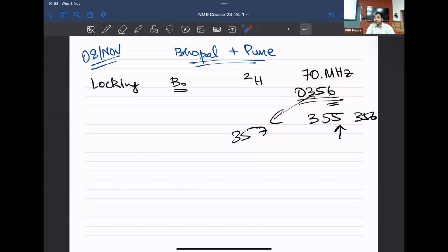Was that? It has to be very big. Yeah, it is rather instantaneous. That's the whole point. That's why the lock should be on throughout the experiments that you end up conducting. Right? Yeah, it is instantaneous and the lock corrects for any deviations that might come.